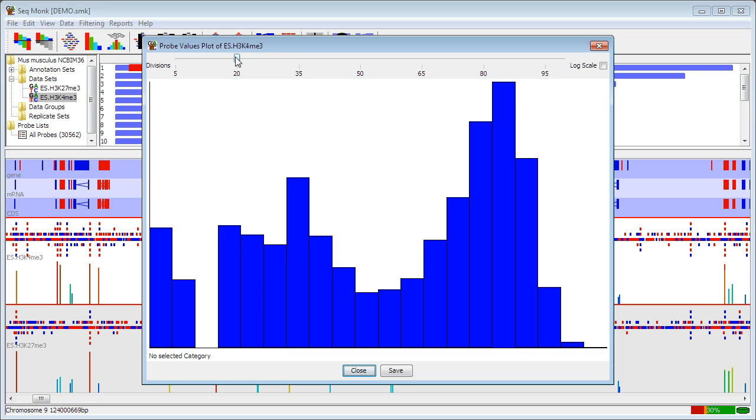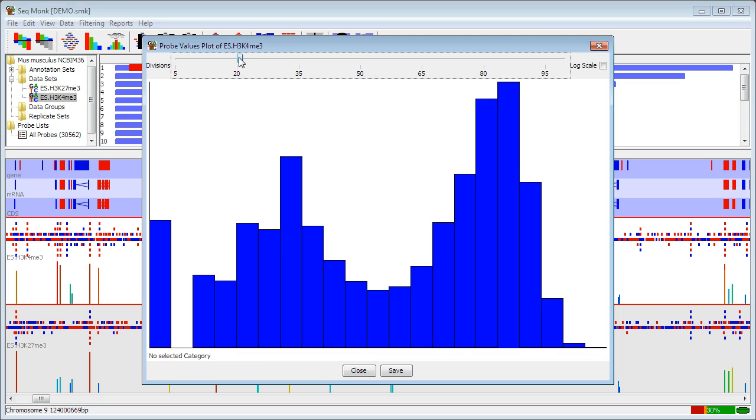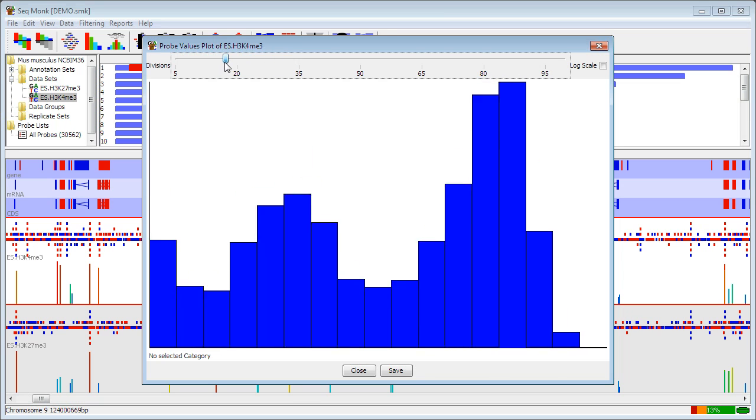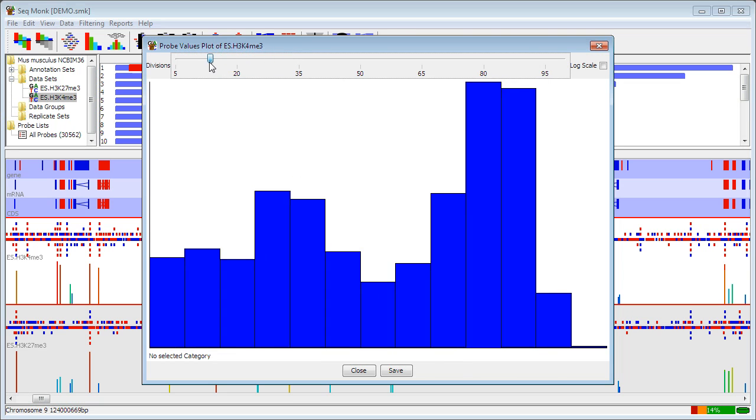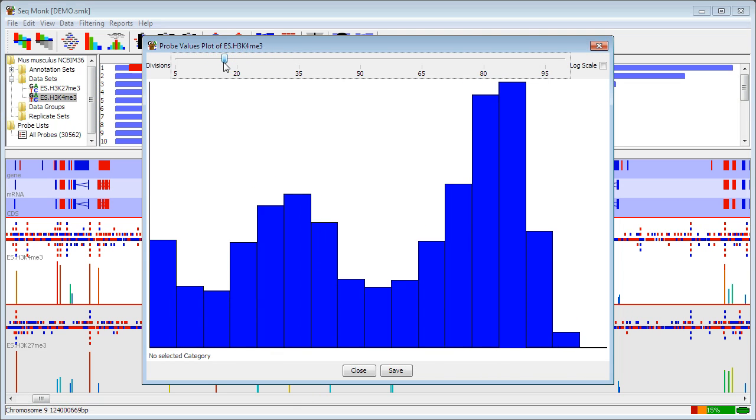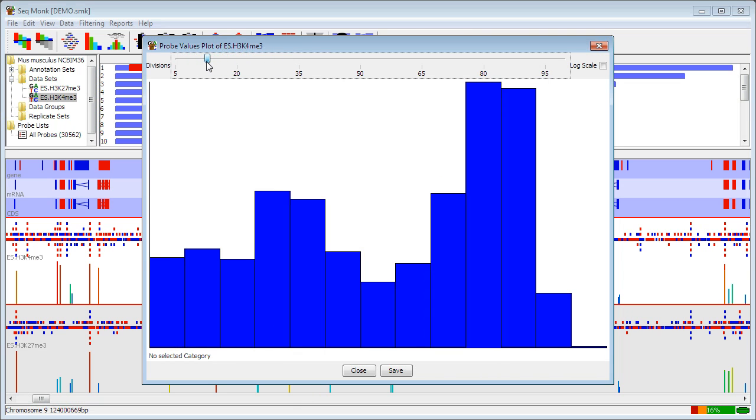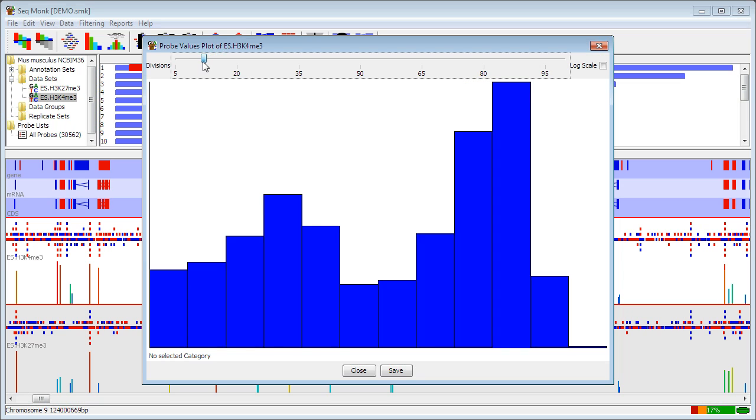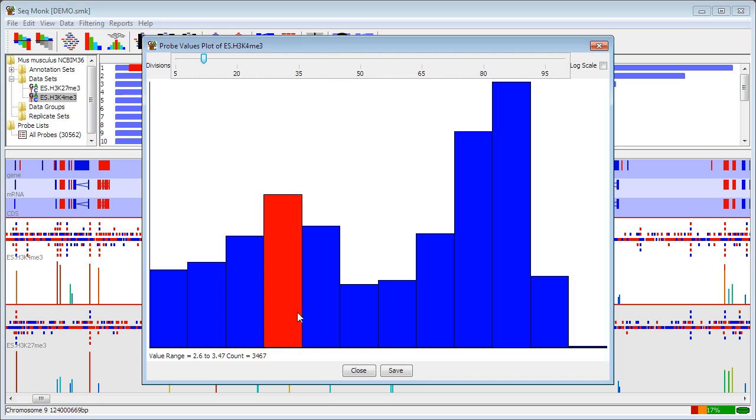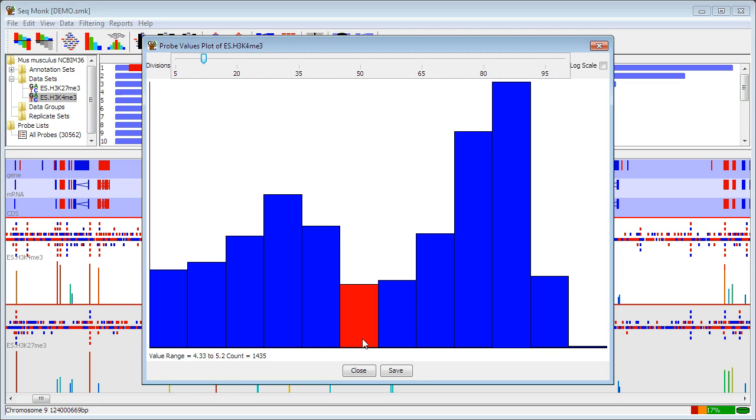I can drag the little slider at the top to try and improve the smoothing of my histogram. And that's probably something reasonable so I can see that actually in this case I have a bimodal distribution where I probably have a set of probes that don't contain this particular modification and a set of promoters that do. I can do that for any individual data set.